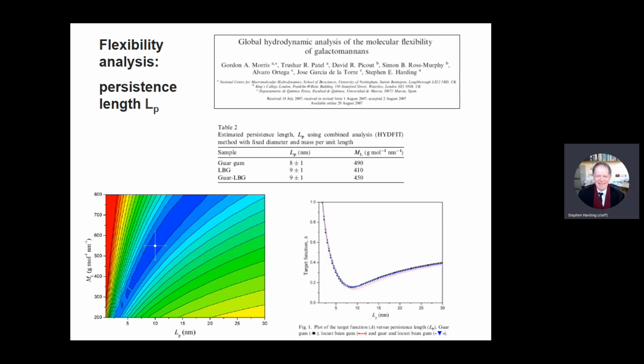But when you're making measurements on solutions, it's what we call soft data, because sometimes you're wondering whether it depends on the instrument or who is operating the instrument, or do you get the same answers if you use light scattering to get molecular weight, the weight average? Do you get the same answer you get from sedimentation equilibrium? You should do.